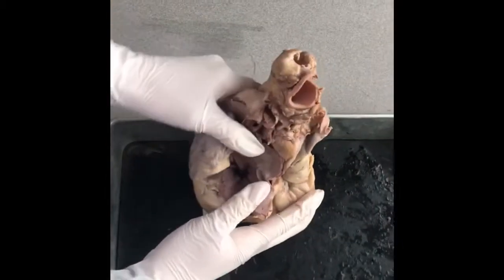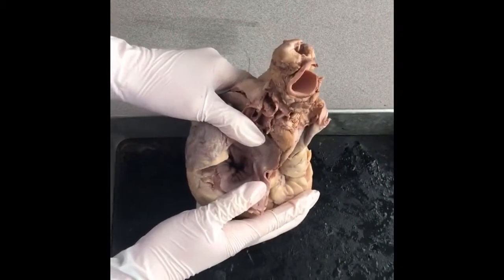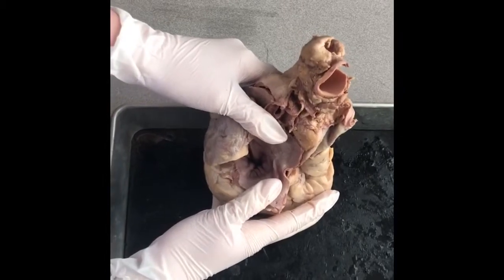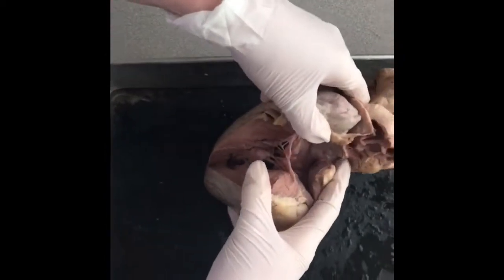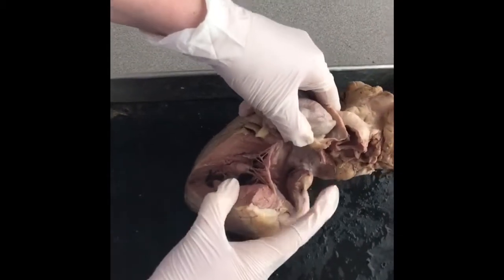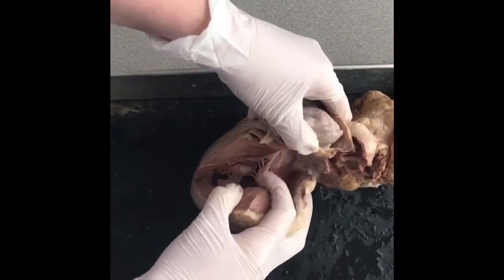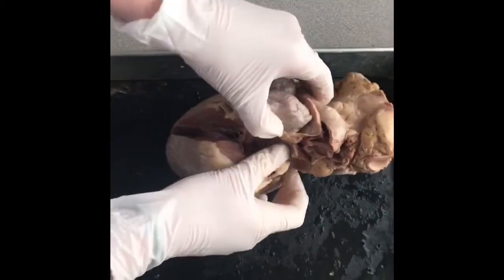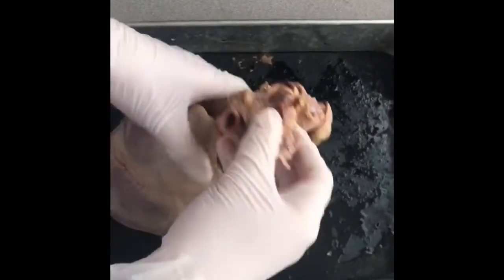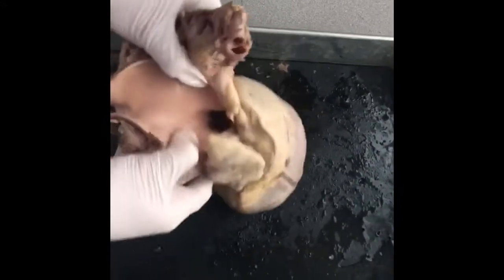This is where the pulmonary veins empty into the heart. It empties oxygen-rich blood from the lungs into the left atrium. As the atrium contracts, blood flows from the atrium into the left ventricle through the mitral valve. This valve will close so the blood won't flow backwards. Once the ventricle contracts, the blood leaves the heart through the aortic valve into the aorta and to the body. There's the aortic valve.